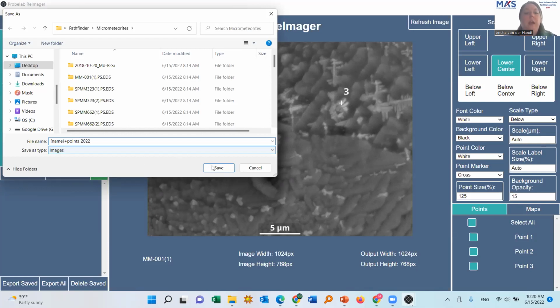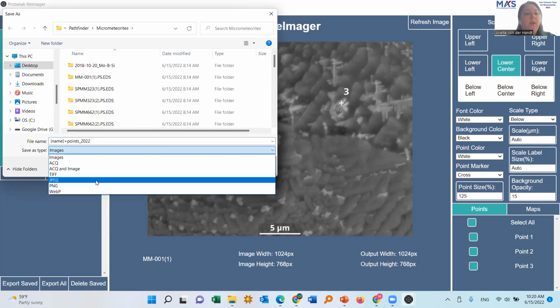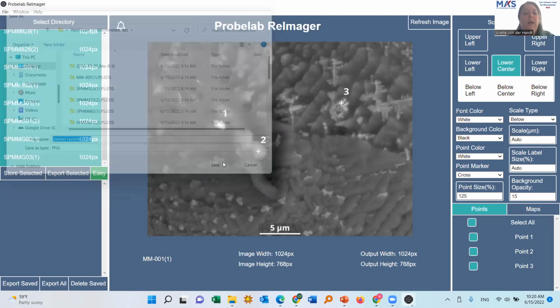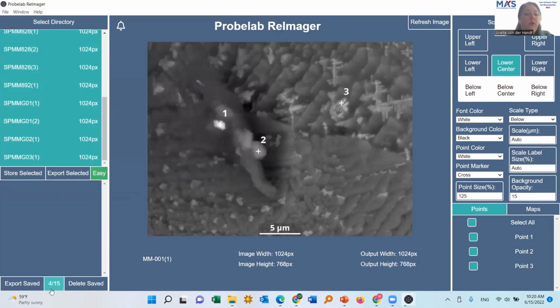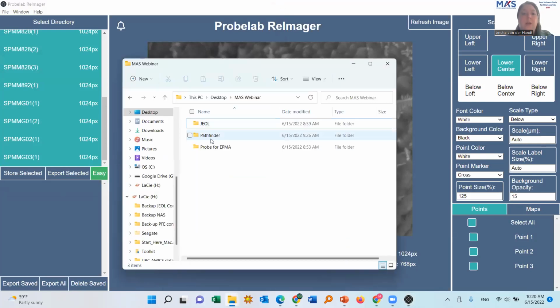Then I can export it as TIFF, JPEG, PNG, or WebP. So let's do that. It just goes through and shows me down here where we are, and it's incredibly fast. Then if we go into the folder, I could also have changed the folder if I wanted.